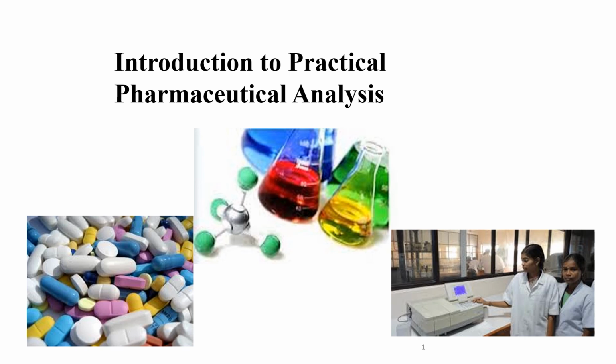This is the third day of our practical video on the course of practical pharmaceutical analysis. In the first two tutorial videos, I'm sure you got some pointers about standardization and estimation of the amount of active ingredient as well as the purity of aspirin.